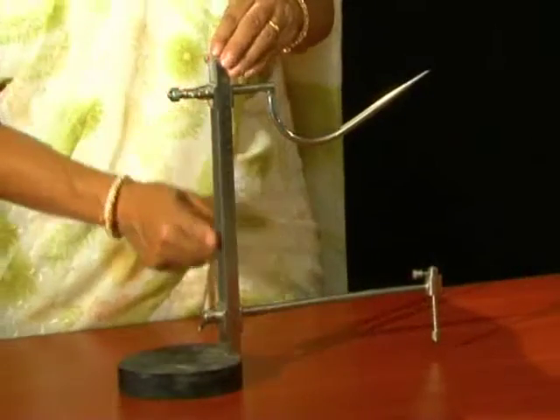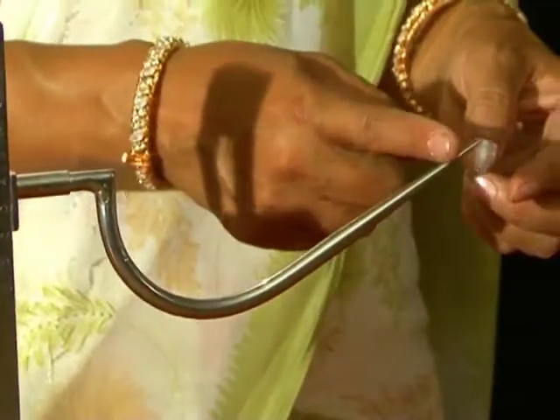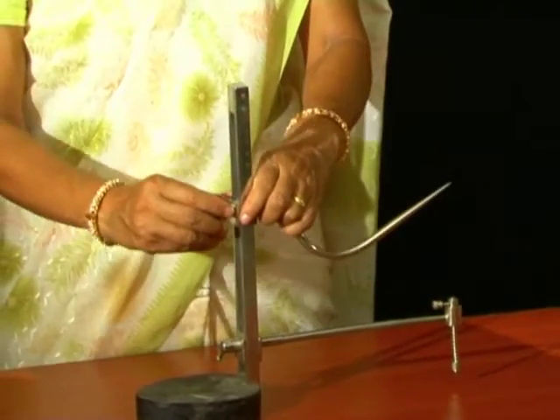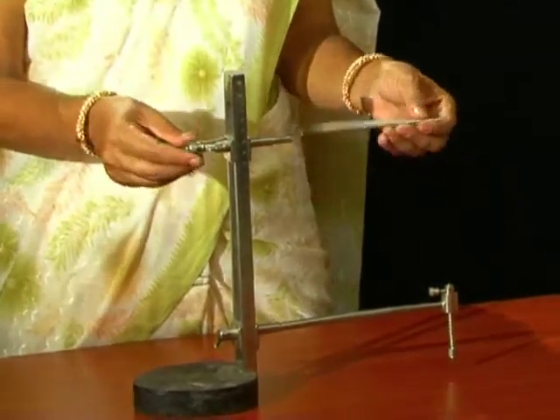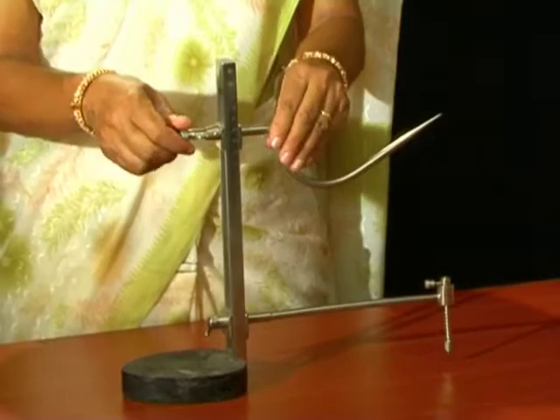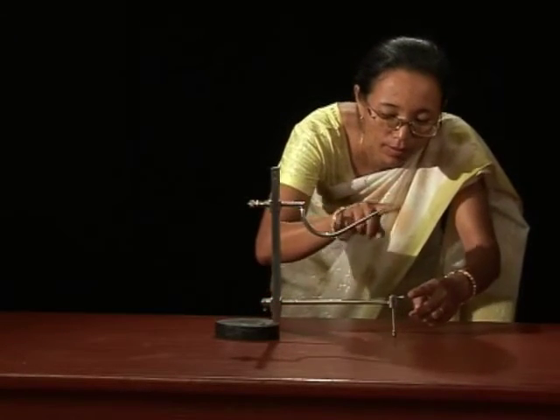It consists of a vertical bar bearing two horizontal needles. The upper one is curved and pointed. The height of the upper curved needle can be adjusted to the required level using screws provided at the vertical bar. It can also be rotated in any direction for convenience while drawing the craniograph. The lower one carries a pencil holder exactly vertical in line with the point of the curved needle.